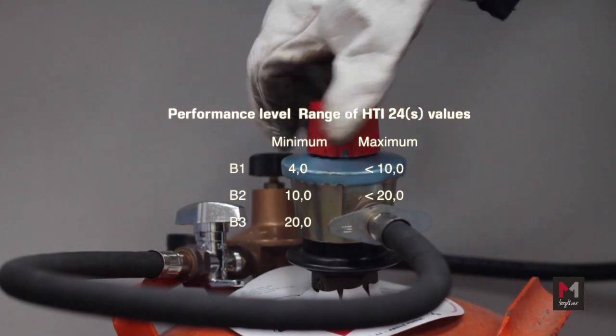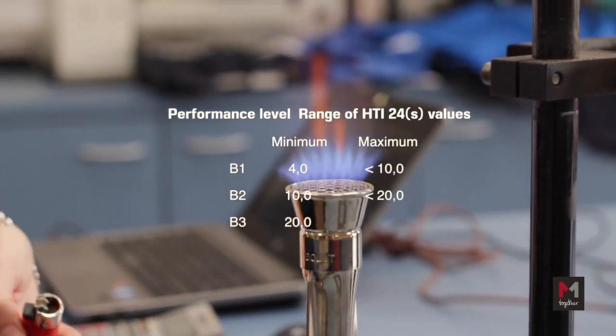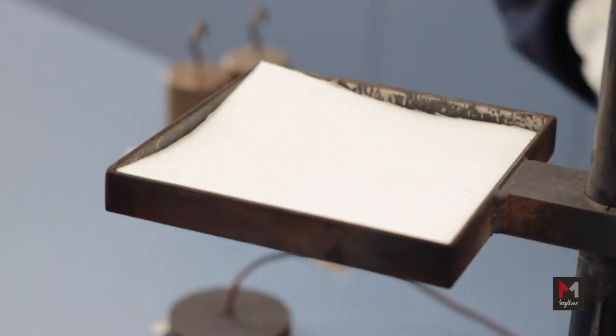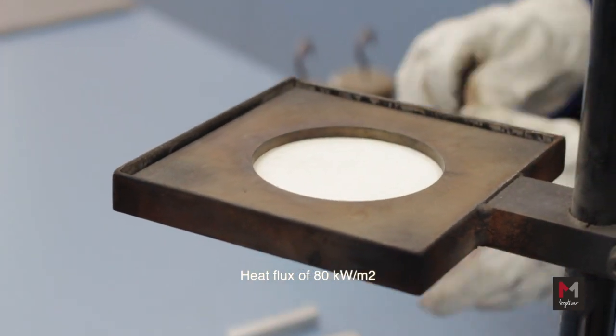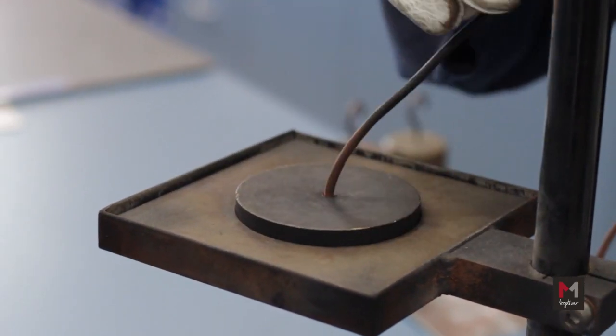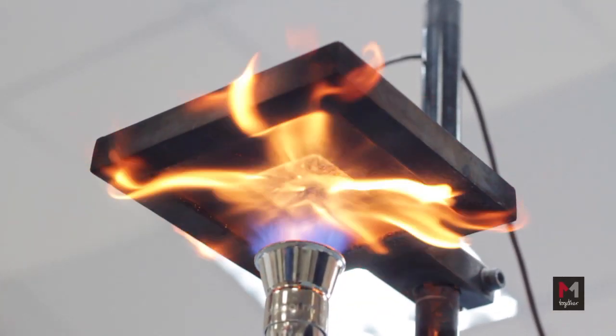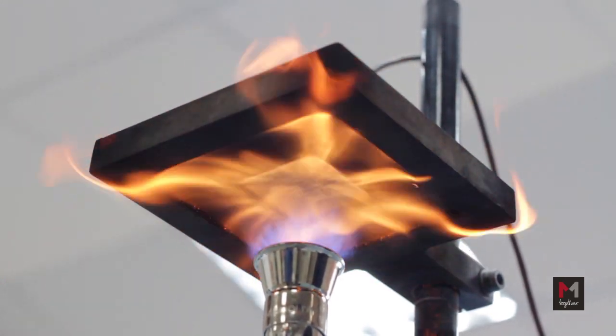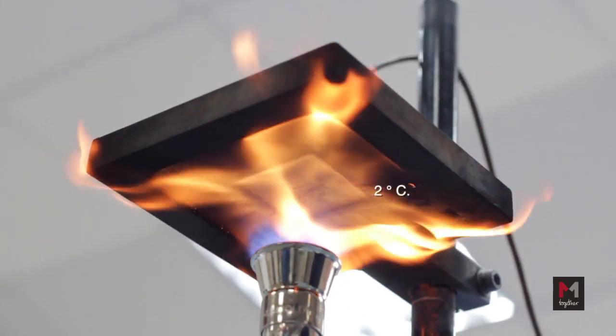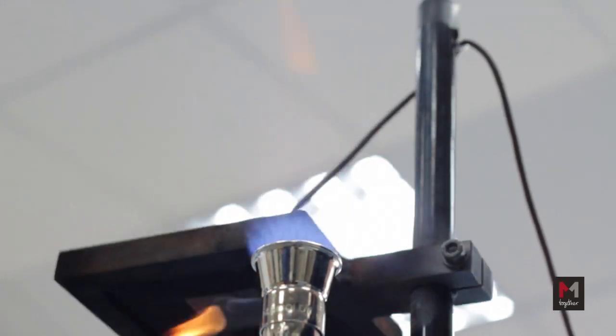Convective Heat: For each material or set of materials at least three specimens shall be tested with size of 140 millimeters by 140 millimeters. Test Method: The specimen is subjected to a heat flux of 80 kilowatts per square meter. The heat passing through the sample is measured using a calorimeter placed above the fabric and in contact therewith. It will be measured the time needed in seconds to produce a temperature rise of the calorimeter of 24 degrees Celsius. The specimens of multi-layer assemblies must correspond with the usual order of the layers.